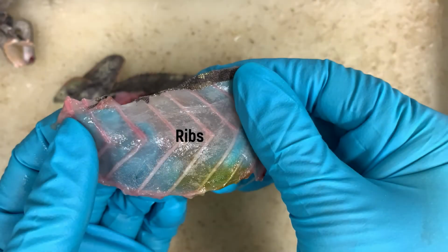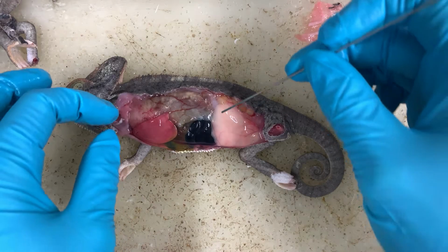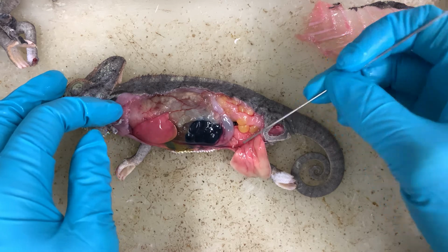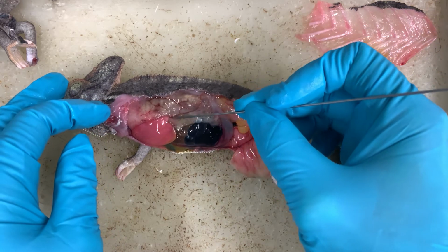The ribs are divided into 2 segments: the vertebrocostal segment, which is bony and runs postero-ventrally, and the sternocostal segment, which is cartilaginous and runs antero-ventrally. Postero-ventrally, there is a large pinkish fat pad in this specimen, which can be lifted away to reveal the posterior organs.